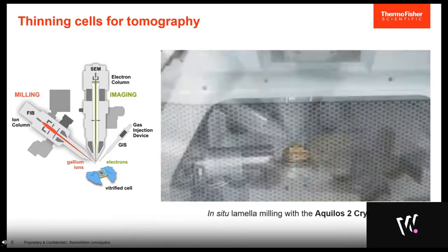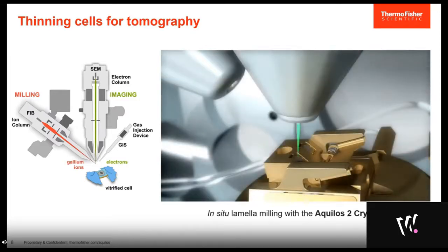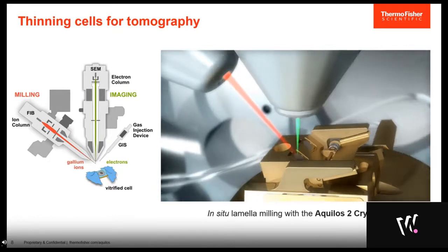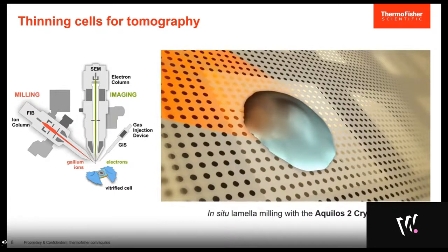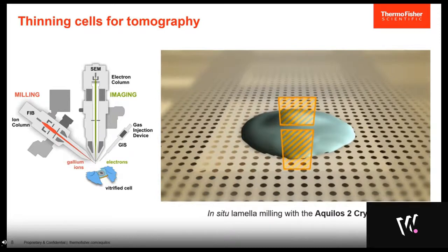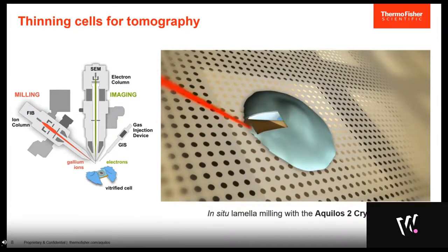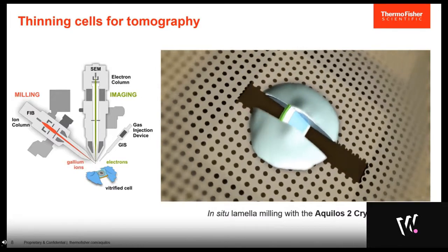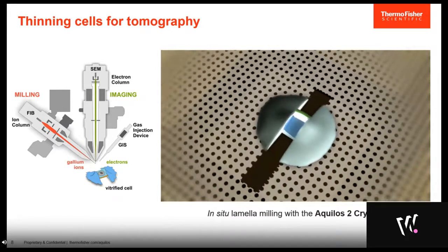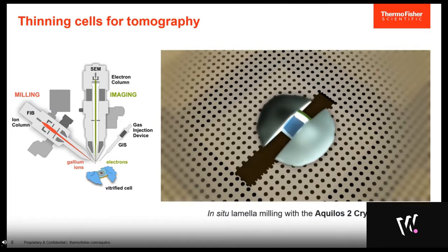Here we go into the system. This is a cryo specimen loaded onto the cryo stage. We use the electron beam to image the sample as in a scanning electron microscope, and then use the ion beam to manipulate and remove areas of interest. The ion beam removes material from the cell, and what is left behind is a thin lamella still connected to the sides of the cell. By this process we create a sample that is electron-transparent, allowing us to look into the interior of a frozen hydrated cell.